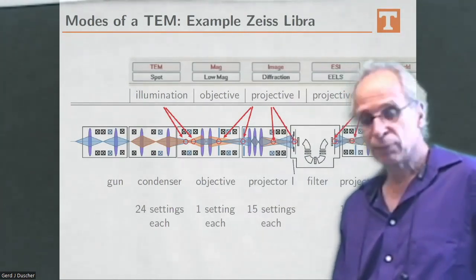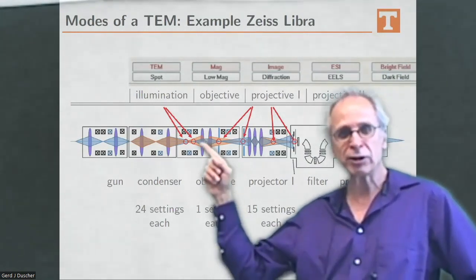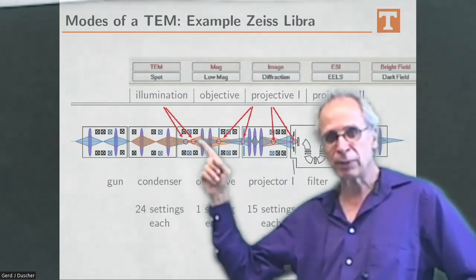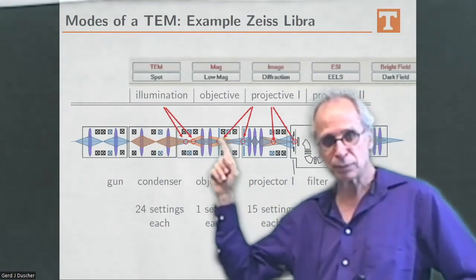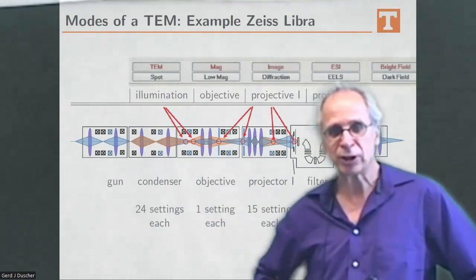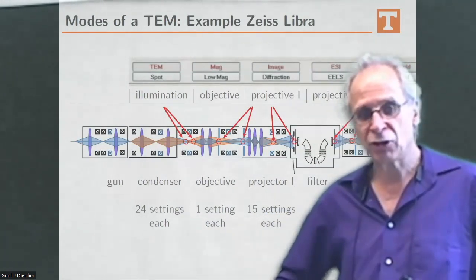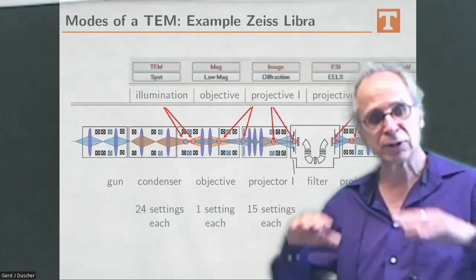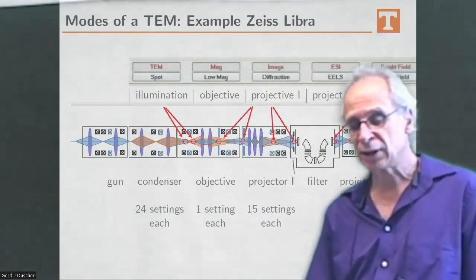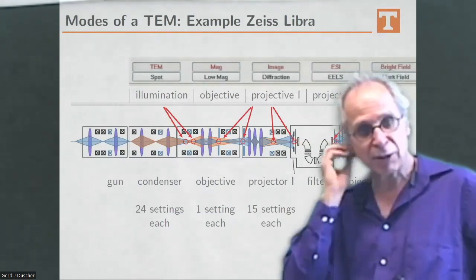Okay, forgot one detector. We have the objective lens here. The electrons come from here. And so in a modern electron microscope, so here's the sample. So below this upper part of the objective lens is the energy dispersive X-ray spectrometer. So it's just the silicon detectors that are sitting around there in a circle. Okay, so this is our microscope.